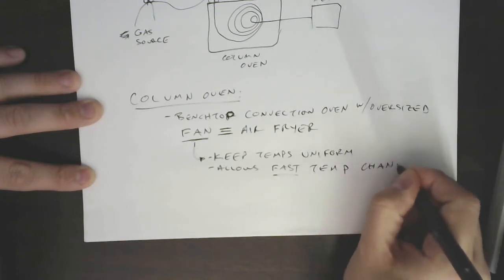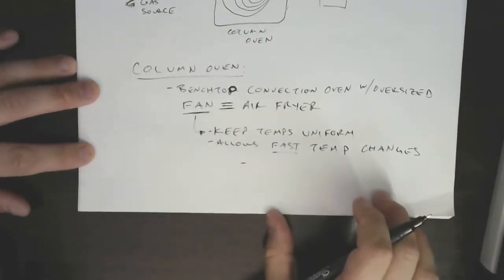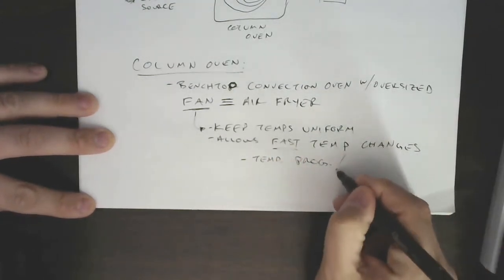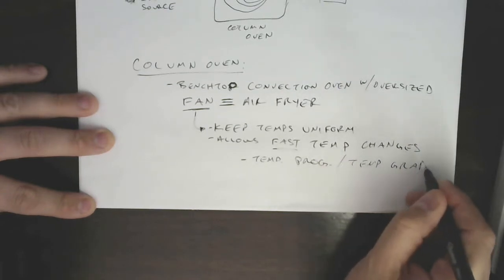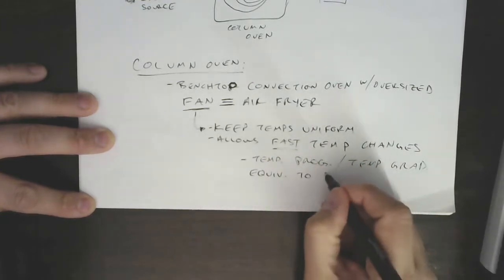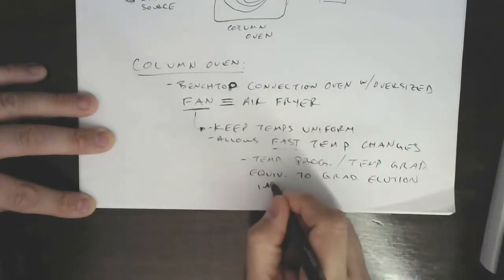And that is important. Fast temperature changes are important because, and we've talked about this in the past, but I'm going to reiterate it here, temperature programming, or temperature gradients, is the equivalent to gradient elution in LC.